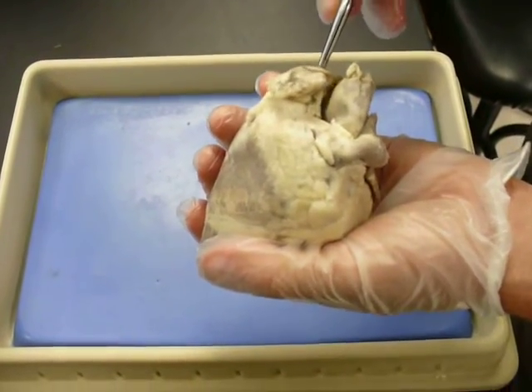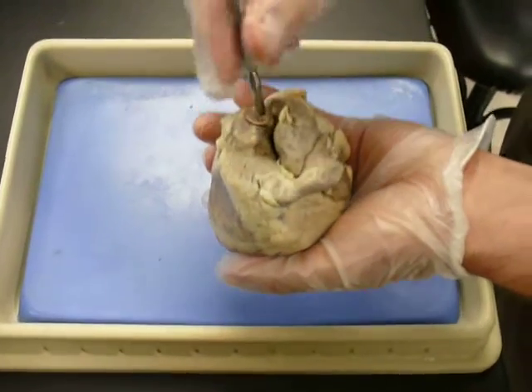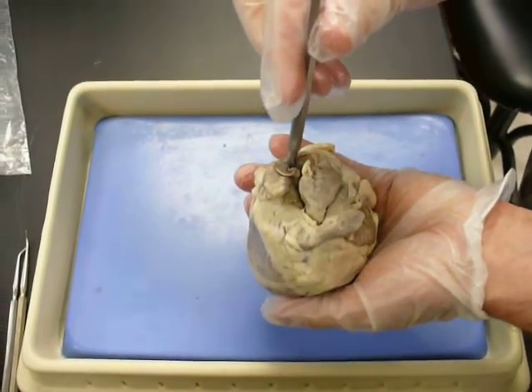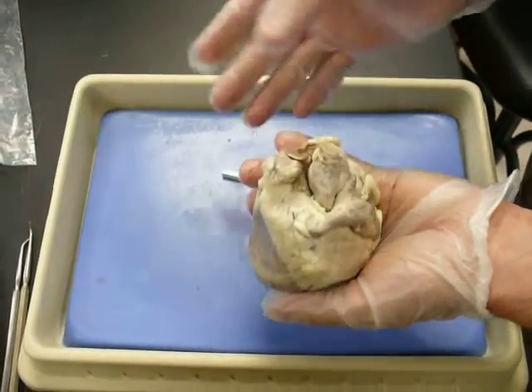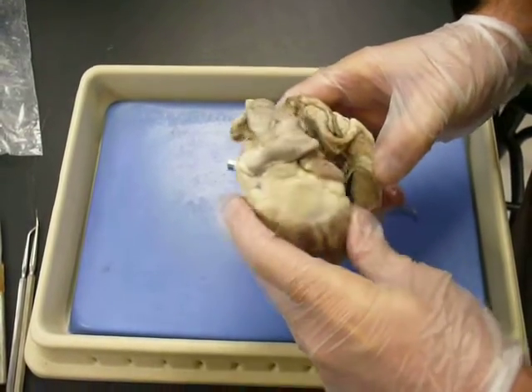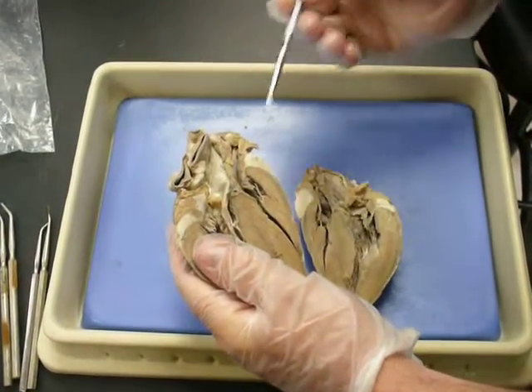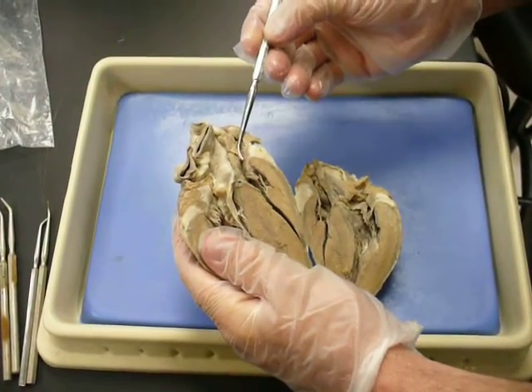This is the superior vena cava, coming down like that. You can see where the actual probe is inserted is that superior vena cava. I'm going to open it up like a book — slowly. Now, this is that superior vena cava coming down, just like that.